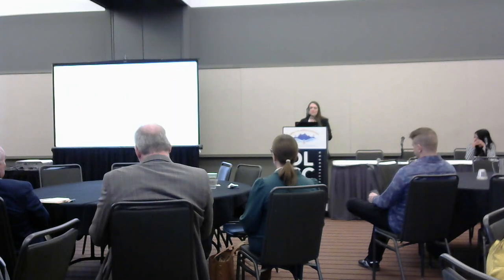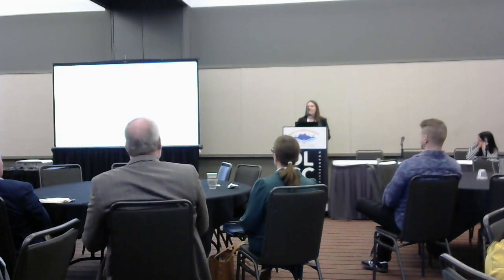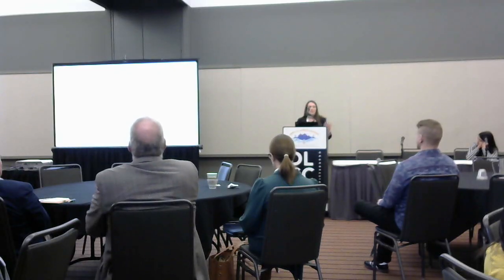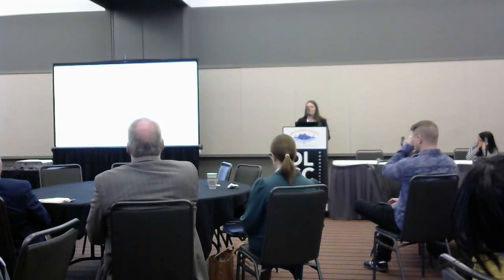So when I'm sitting down with clients, it's pretty often that I hear, is my image good? Or if they've gotten to the analysis approach already, is my analysis approach good? And these are important questions, but I like to frame them more as, is my image good enough to answer my science question? Is my analysis approach good enough to answer my science question? So how do we determine what good enough is?